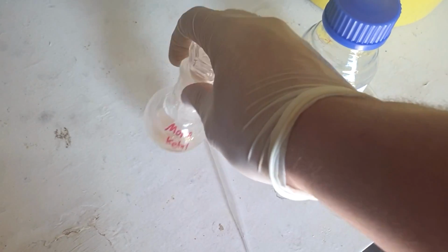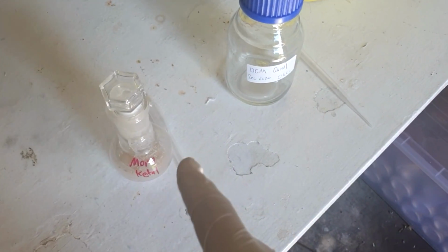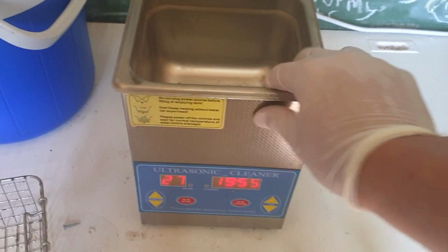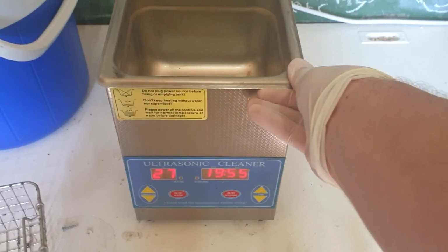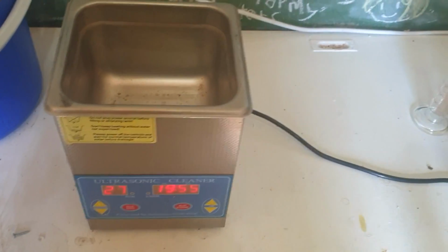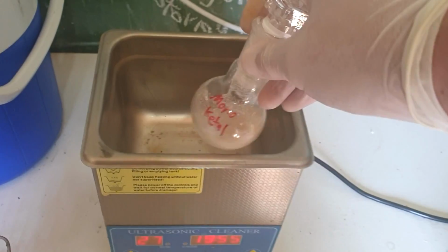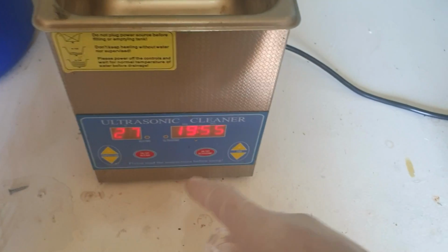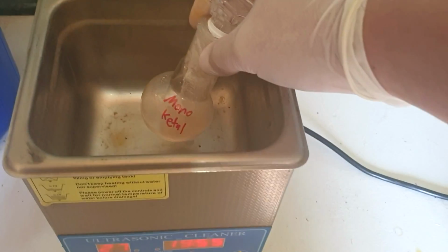There's a lot of other more obscure suggestions like phase transfer reagents, but there was one obscure suggestion which I was really a fan of. I mentioned the word ultrasonic, so I've gotten this out of some rusty corner of the shed. Yeah, you might recognize this from quite some time ago. I used it before at some point for something. Given the small reaction volume and the fact that this can actually heat a water bath, I want to try running the reaction mix in here.